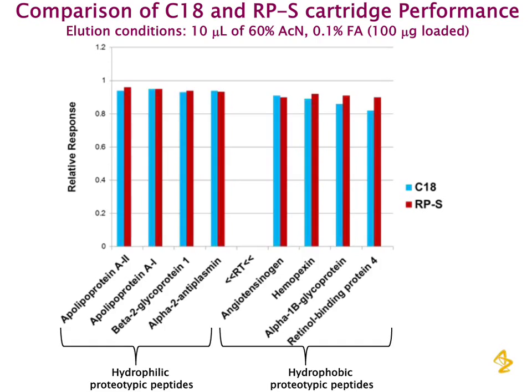Jason Russell and co-workers at Agilent Technologies have shown that the recovery of hydrophobic peptides was reduced when the load mass decreased below 10 micrograms. However, the recovery, even when low, was reproducible. We have confirmed these findings with our peptide panel.